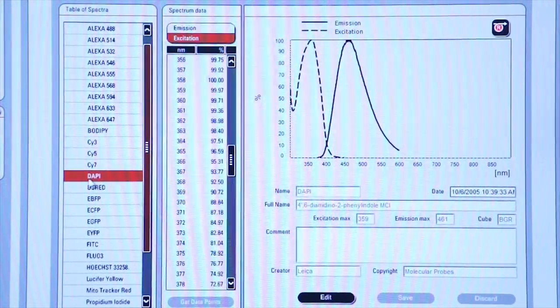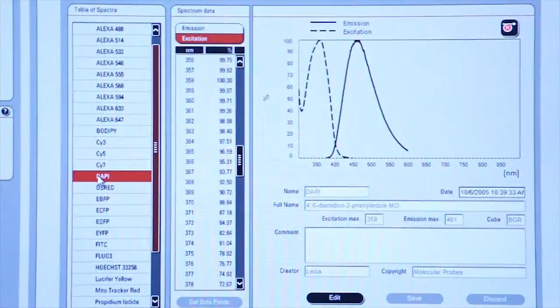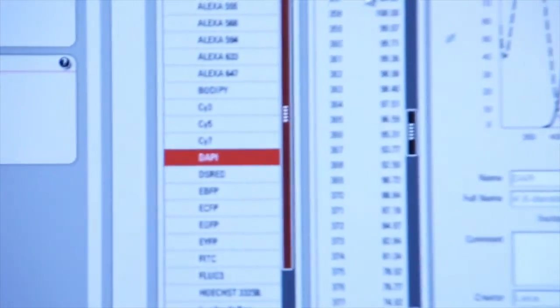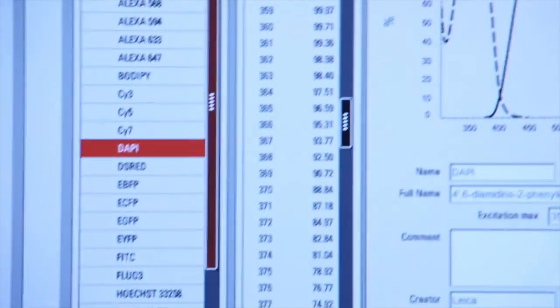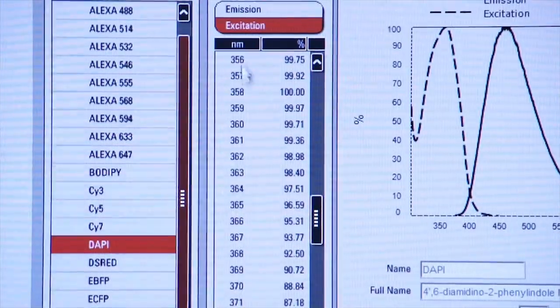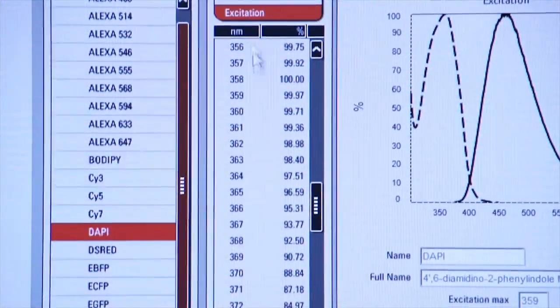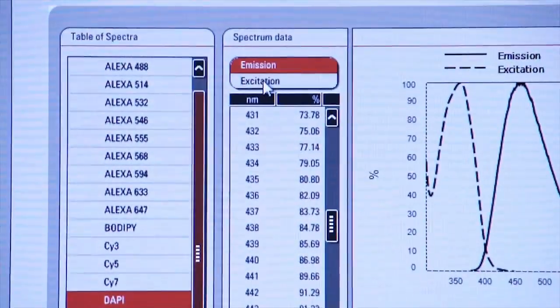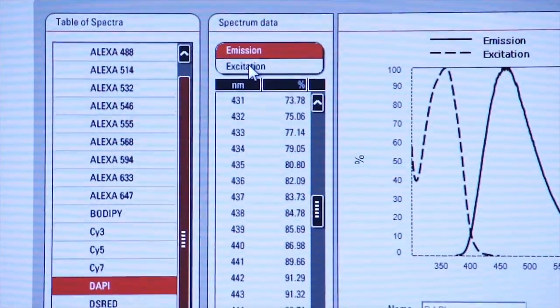Notice that I've selected DAPI, and in this column I see the excitation wavelengths and the emission wavelengths for this particular fluorophore.